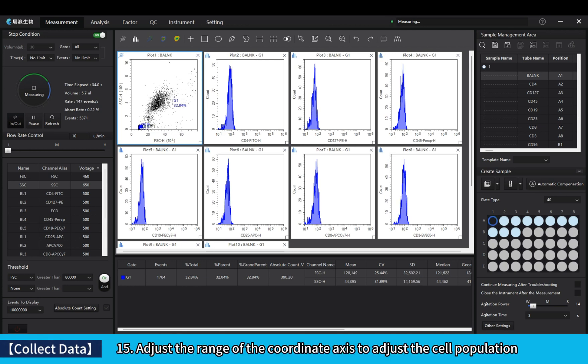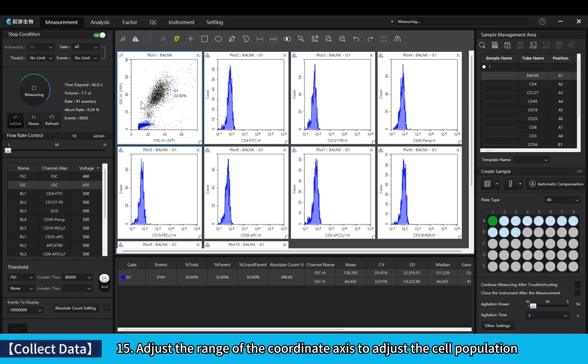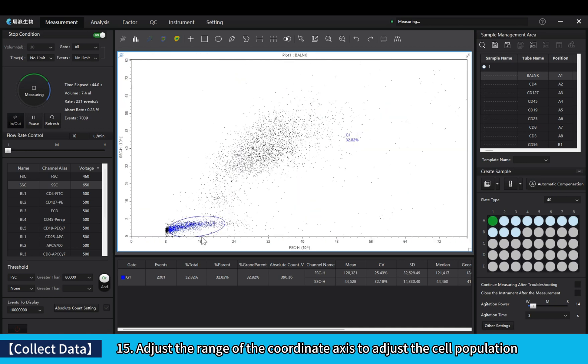Adjust the range of the coordinate axis to adjust the cell population.